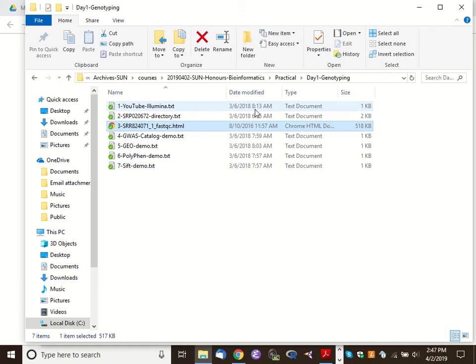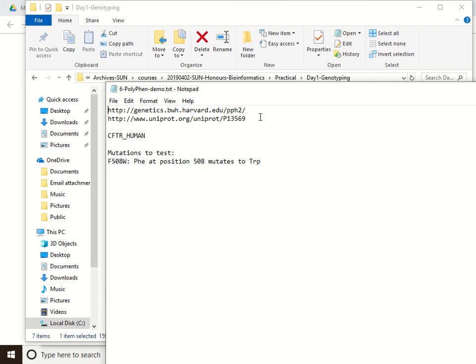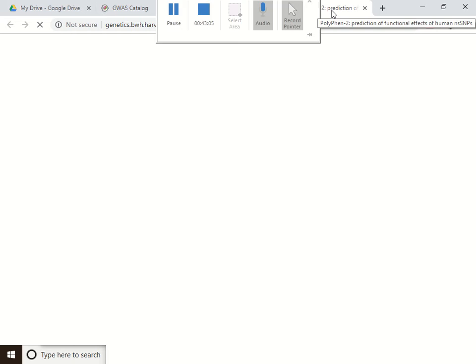Okay, PolyPhen. Prediction of functional effects of human non-synonymous SNPs.